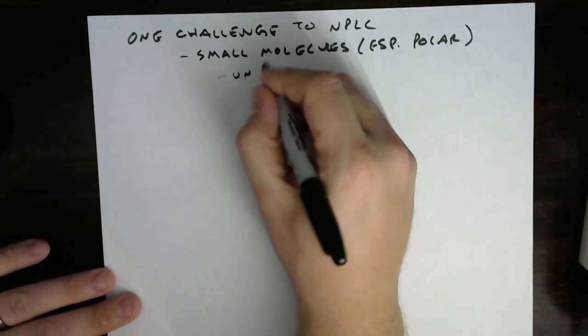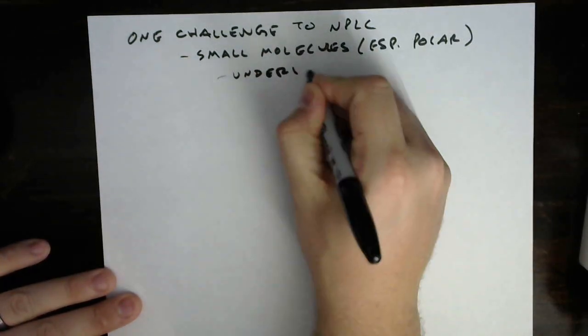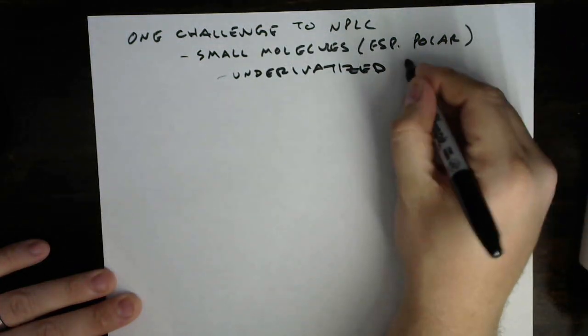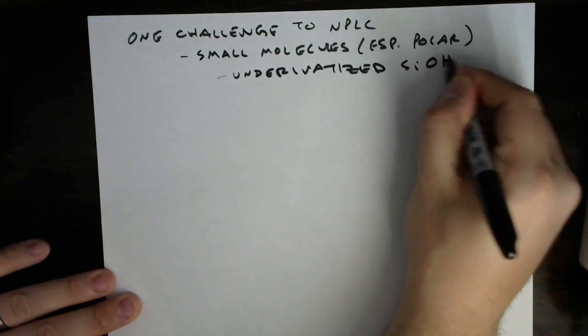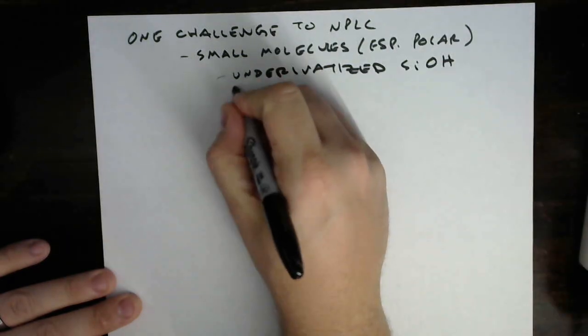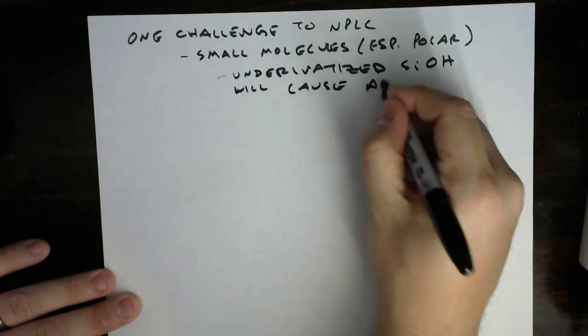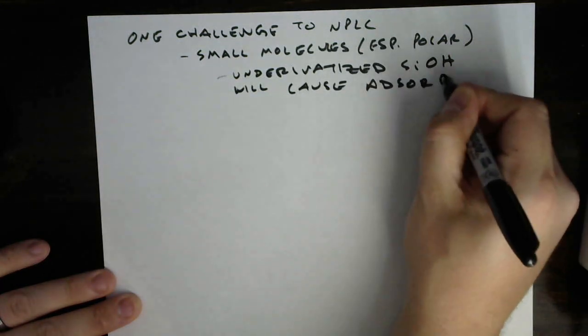So the underivatized silanols are going to cause adsorption, which is the thing we're trying to avoid here, right?